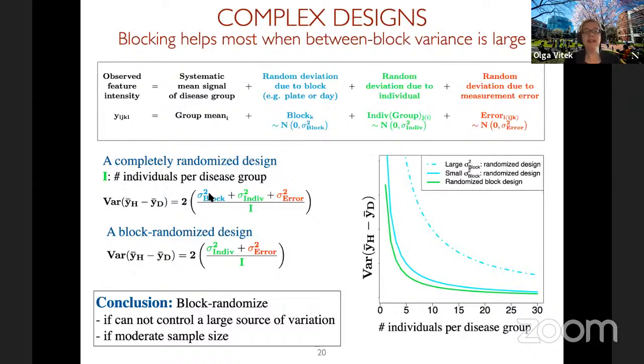So for example, if we do not have day-to-day variation, but we go into all the trouble of blocking and so on, we actually don't gain much, but we can make mistakes, and we also can overfit our data. So at the stage of experimental design, it is useful to have this pilot study to understand how much variance we actually have due to these potential artifacts, and decide whether it is worthwhile going into the trouble of blocking or not. Because again, the price of this is a more complicated experiment and potential overfitting. So blocking is useful when it is necessary, but we shouldn't overdo it, right?